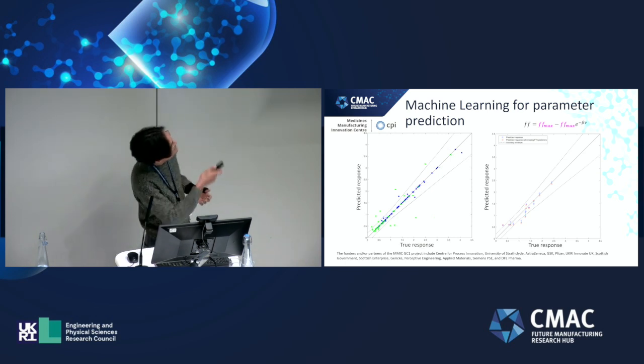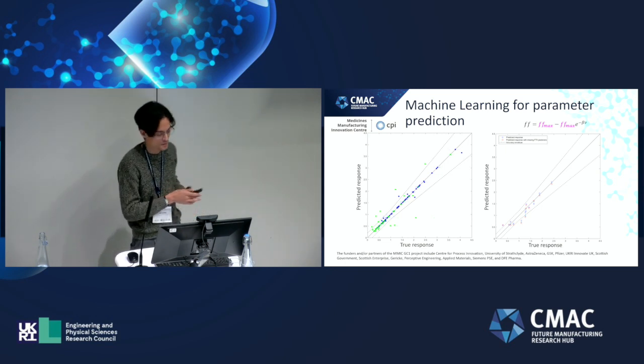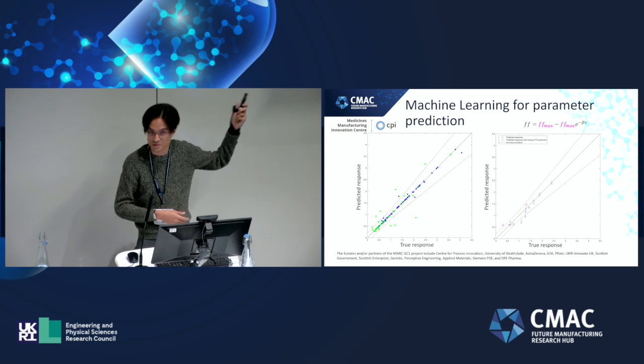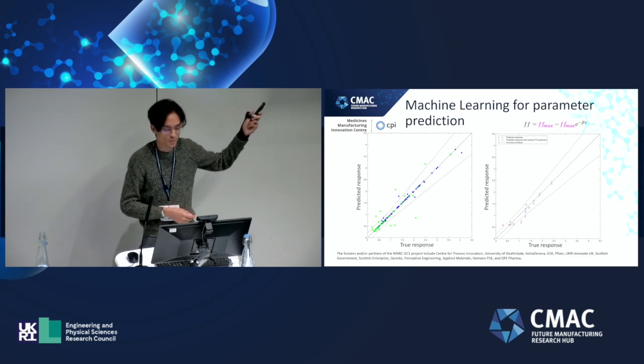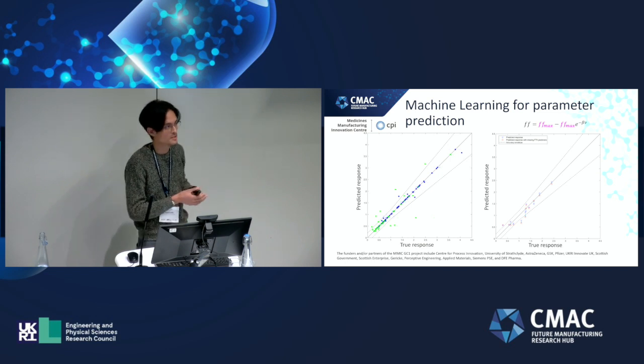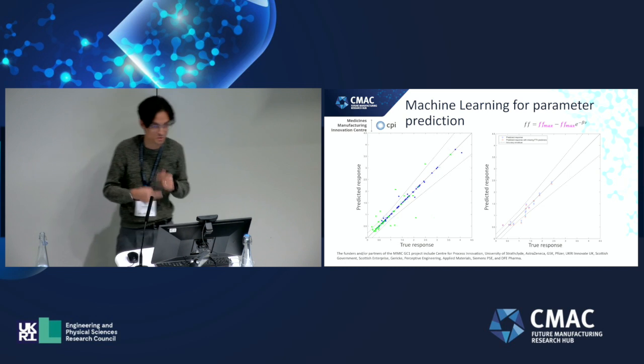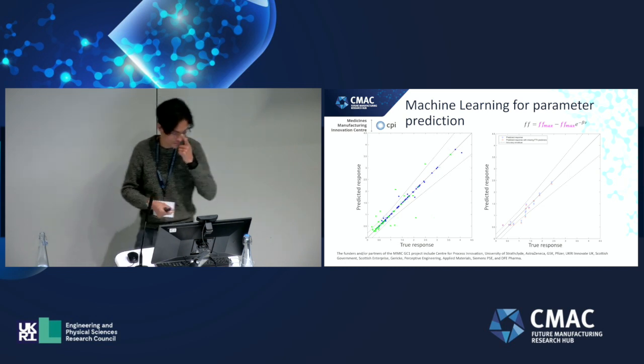What we do want to highlight here is that you can see that some of the data points are a lot fainter than the other ones. You've got solid data points, and the ones that are slightly paler. The paler ones are the true data points. Those are replicates. In some cases, we had 2 or 3 runs per feeder screw material condition. For others, we had 6, 7, 8 data points for that given condition, either true replicates or different RPMs.